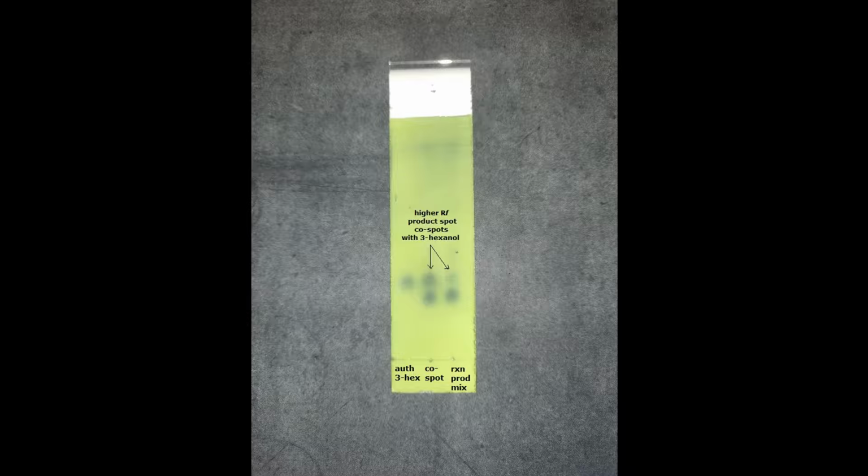For a more complete product analysis by TLC, the reaction product mixture should be co-spotted separately versus authentic samples of 1-hexanol and 2-hexanol.